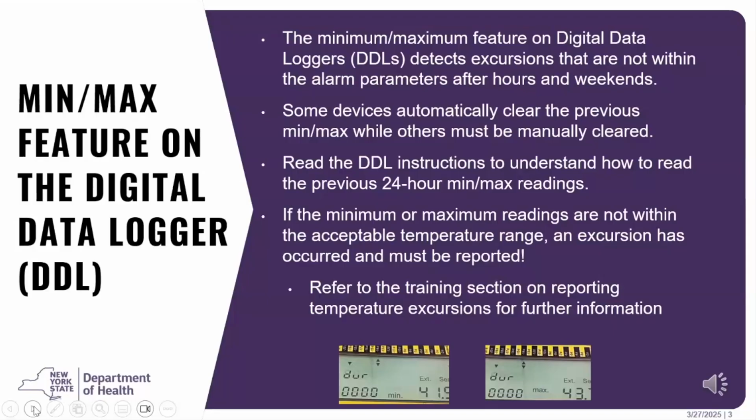If either the min or max temperature is not within the acceptable temperature range, an excursion has occurred and must be reported to the VFC program on the day that it is discovered.